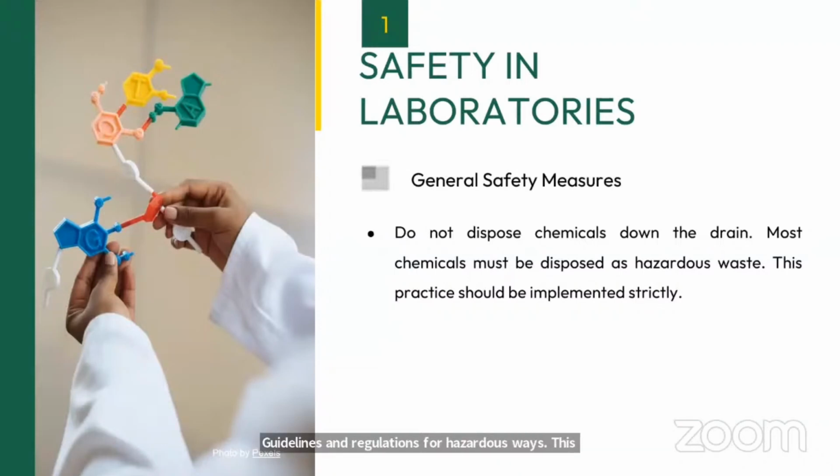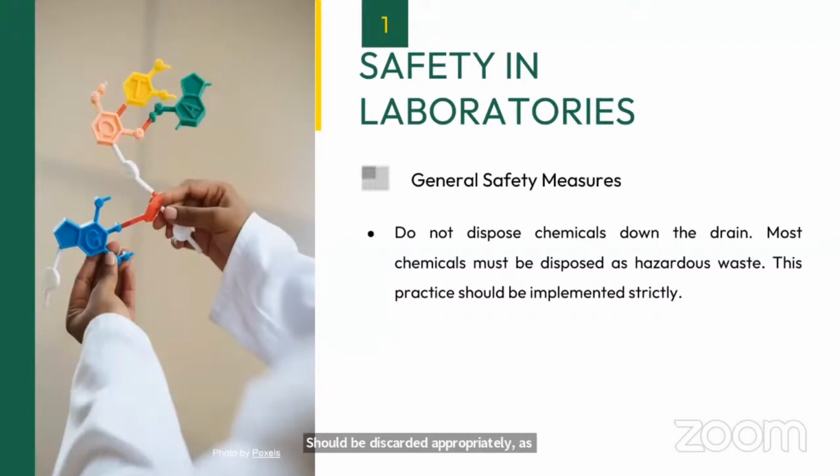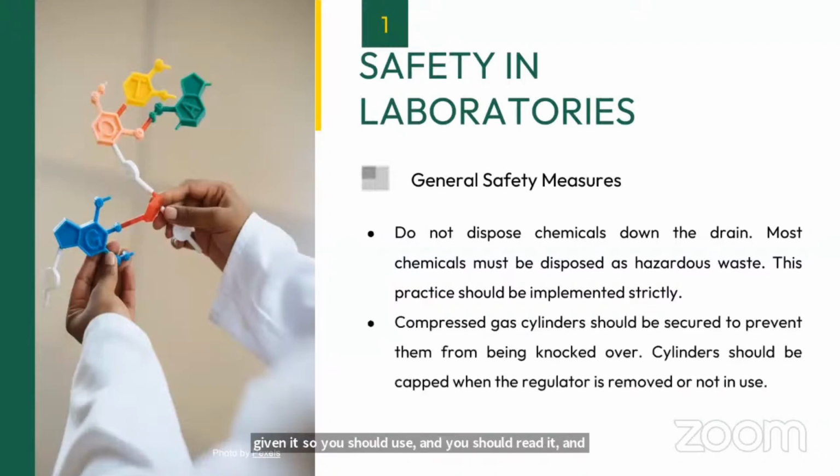Not only biomedical and liquid waste, but even other hazardous chemicals should be discarded appropriately as per their protocol. If you read the kit insert or pack insert, it tells how the chemical should be discarded, so you should read it and dispose of your chemicals as per those guidelines.